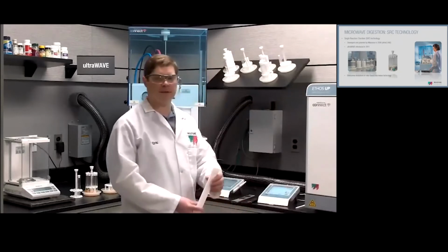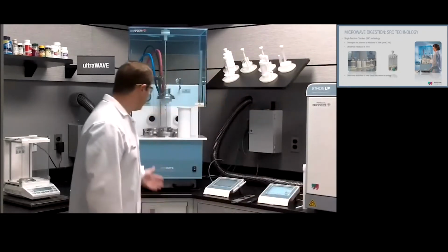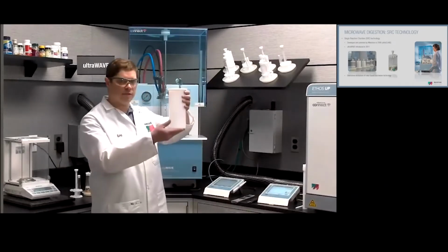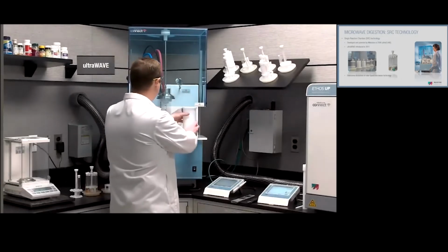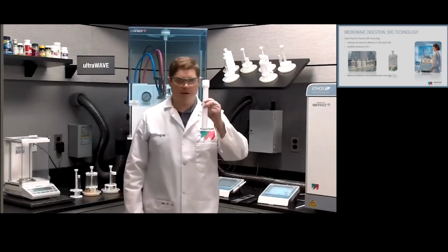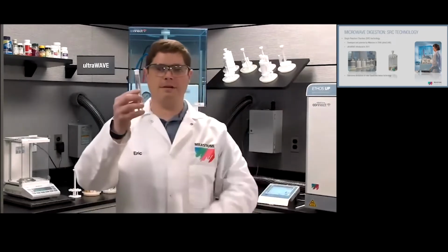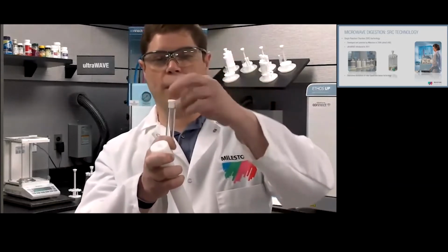With your rotor-based system, instead of having individual reaction vessels, we have a 1 liter stainless steel reaction chamber. Inside, we have a base load of acidified water, which is placed into that reaction chamber, which I'll do right now. Instead of using reaction vessels such as this, we are now using vials with loose fitting caps. So there's no vessel assembly or disassembly required for this step.